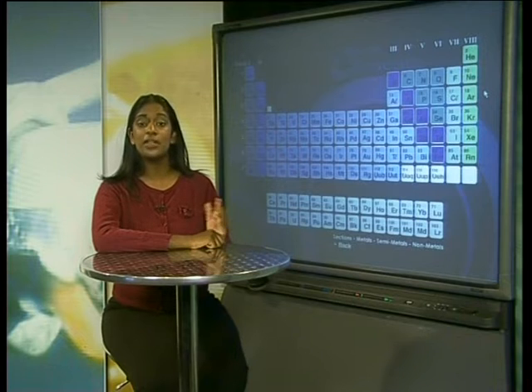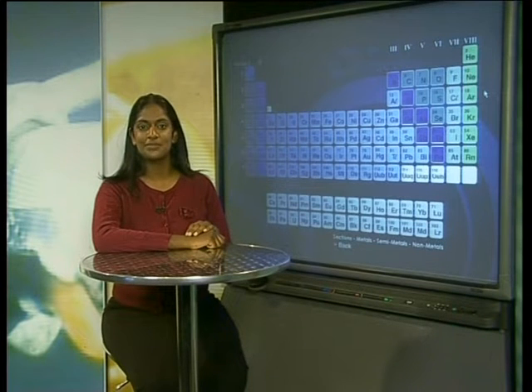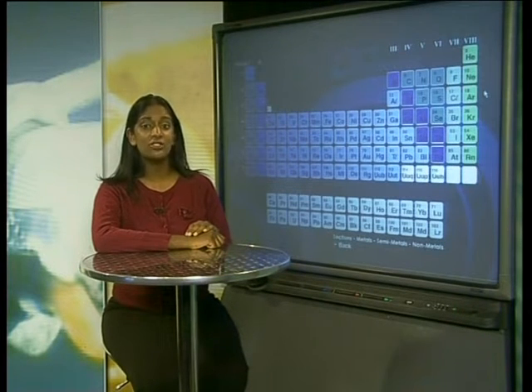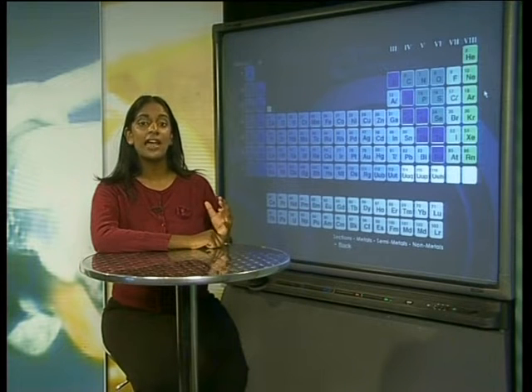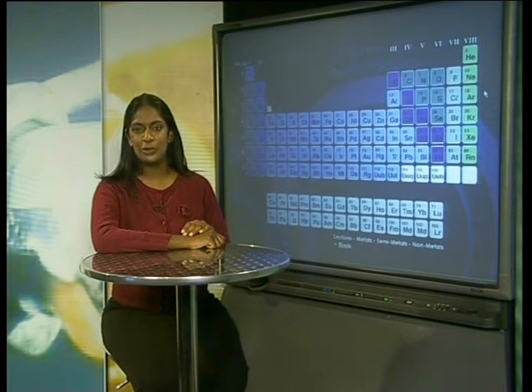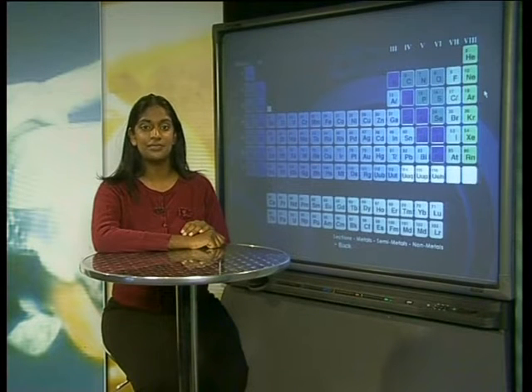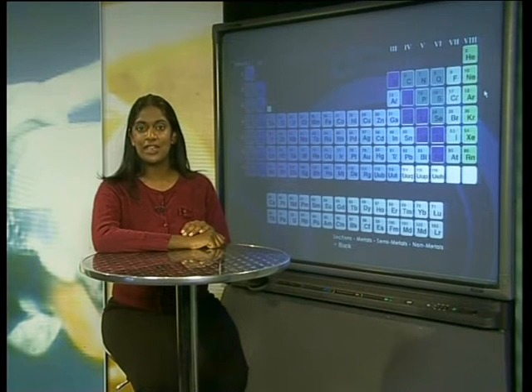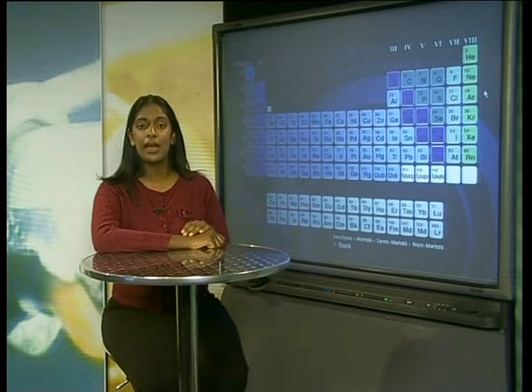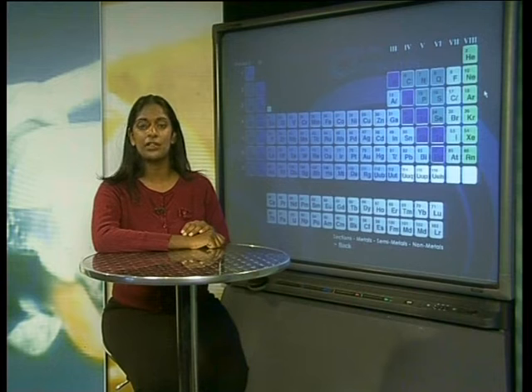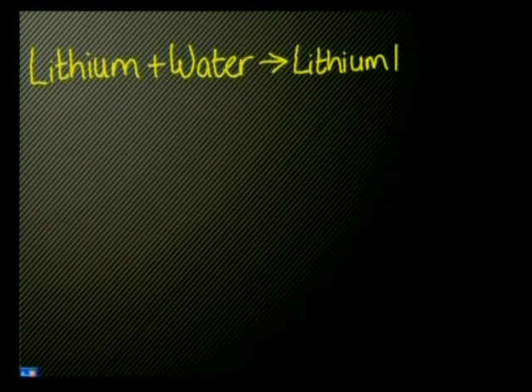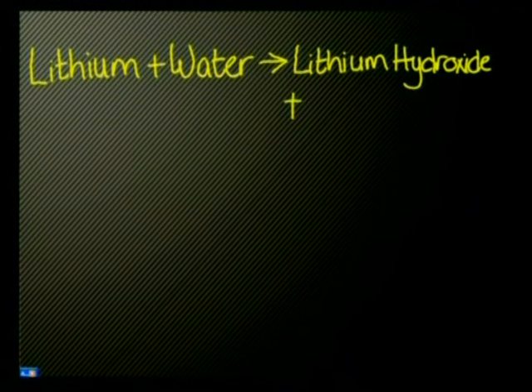What are the conclusions we can make from our observations? The popping sound indicates that hydrogen gas is being released as one of the products of this reaction. The blue colour of the litmus means that a basic solution is formed during the reaction. So we can deduce that the other product of this reaction is lithium hydroxide. The word equation is: lithium plus water reacts to form lithium hydroxide plus hydrogen gas.